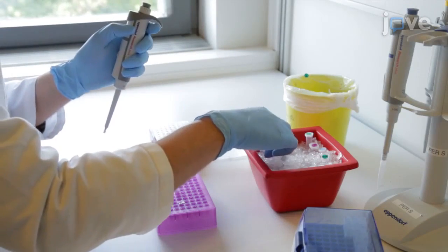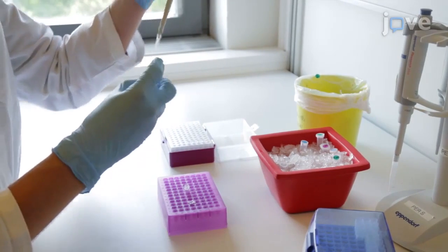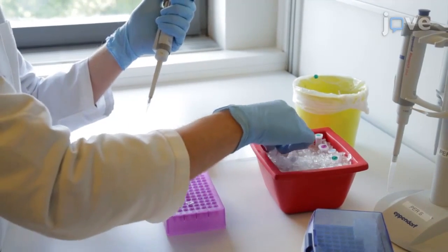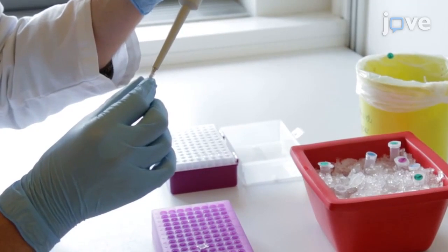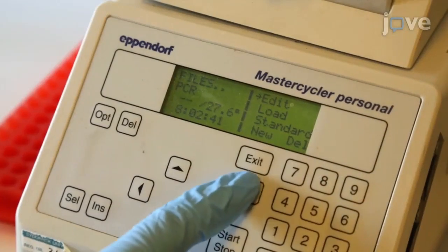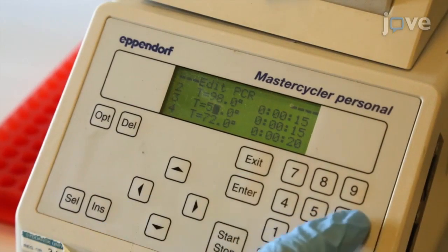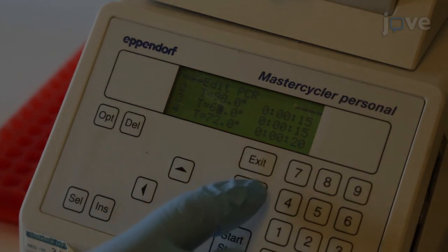Now, to synthesize the mutant megaprimers with BirA hexahistidine forward and reverse primers in a PCR tube, add 1 nanogram of PBAD BirAE CPX with the prepared target peptide sequence as a template. Set up 35 PCR cycles with an annealing temperature of 60 degrees Celsius according to the manufacturer's instruction.